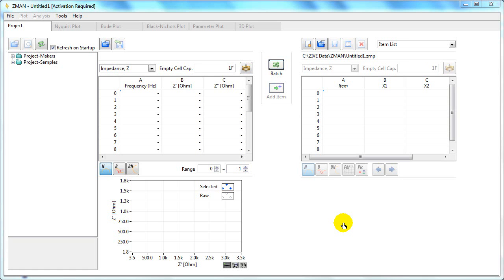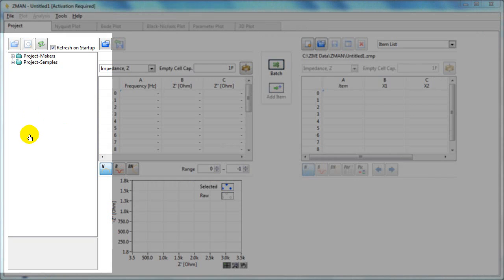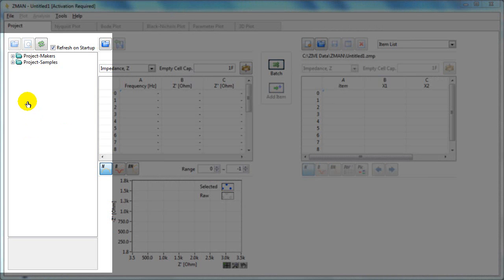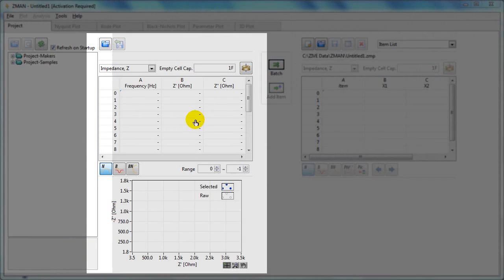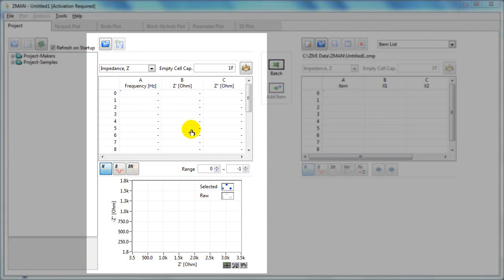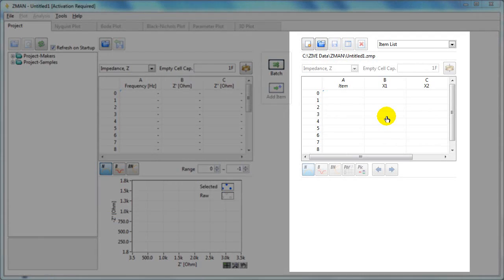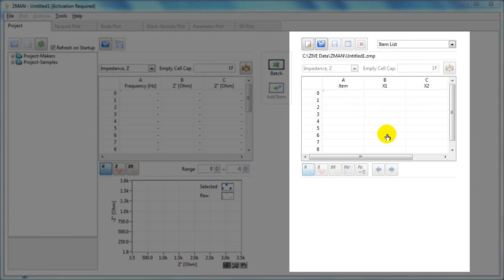This screencast shows you how to open a data file in Zman software. The Zman software basically consists of three sections. On the left we have the data files. In the middle is the preview section. And on the right is the data analysis section.